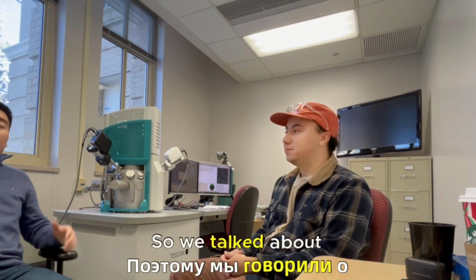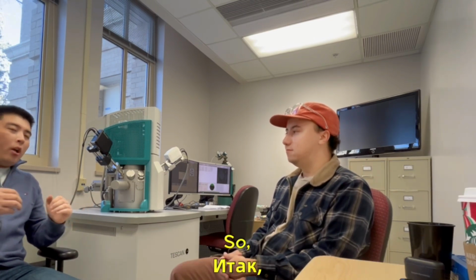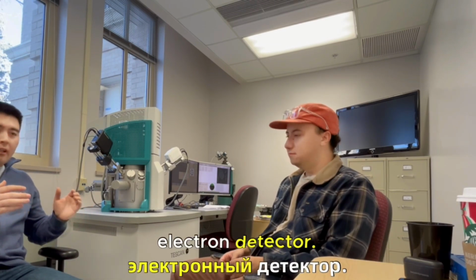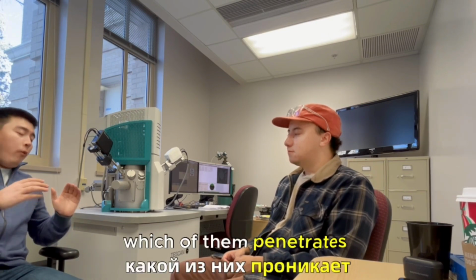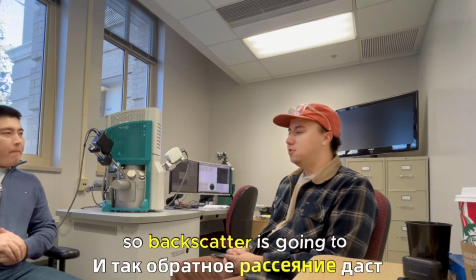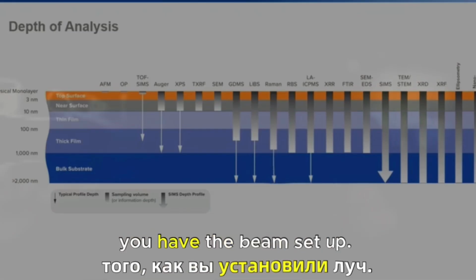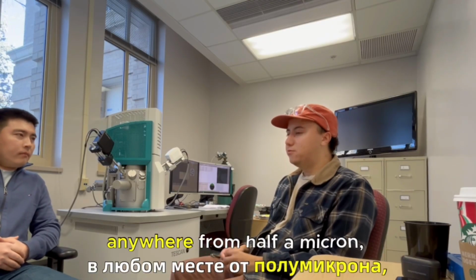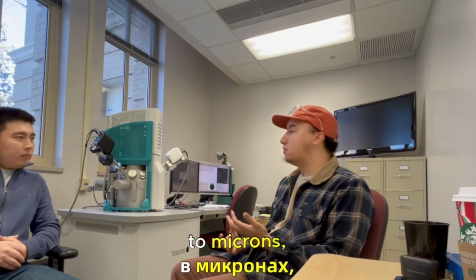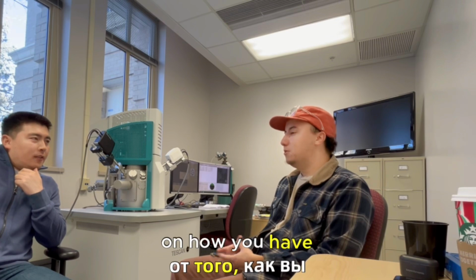Interesting. So we talked about different detectors and different techniques. In SEM, secondary detector, backscattered electron detector, which often penetrates or analyzes the sample deeper? Yeah, backscatter is going to give you the greatest information depth, and that depends on how you have the beam set up. But it can be anywhere from half a micron or hundreds of nanometers to microns plural.